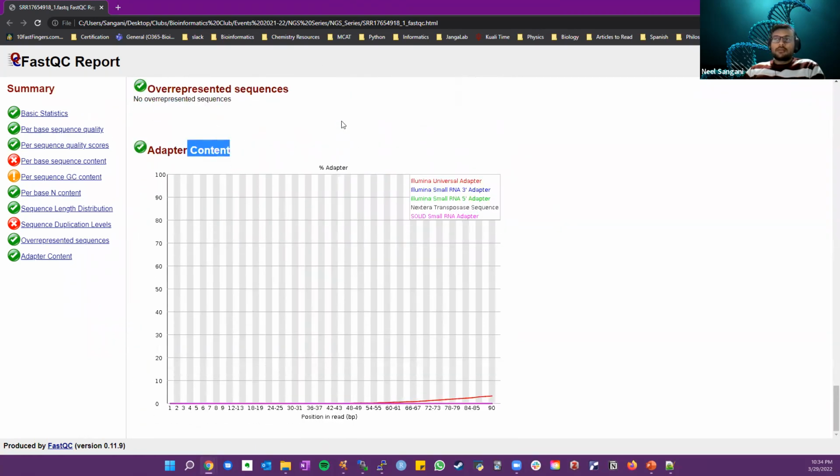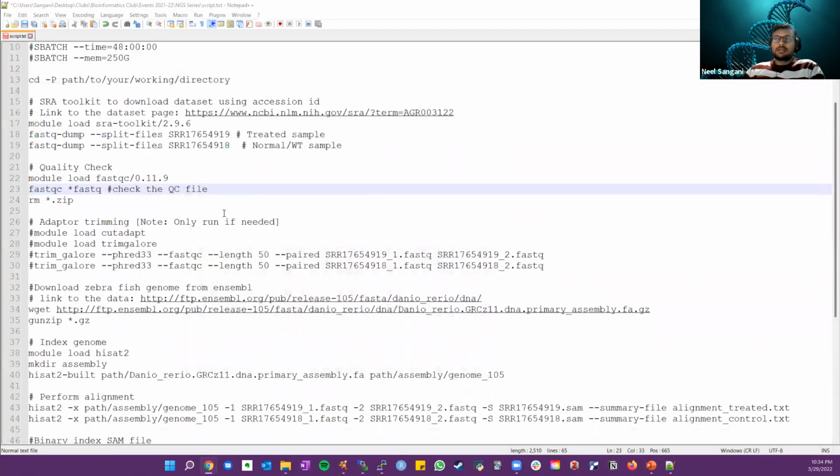So this quality score, base pair count, GC content, read length, duplication, adapter content. And we went over all of this stuff in the first workshop. So definitely consider watching that video if you want to learn about the details of FastQC.